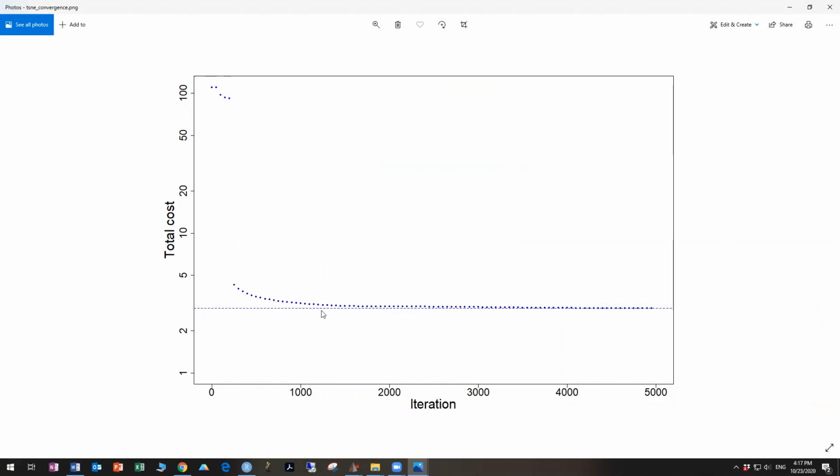So for instance, if we had run only 1,000, which is sort of the default in most flow programs, you'd see it will look like this, and it only recently started to level off. And really by increasing the number of iterations, we get usually better t-SNE representations. Although obviously the longer you run it, the more it's going to take and the less you're going to gain.